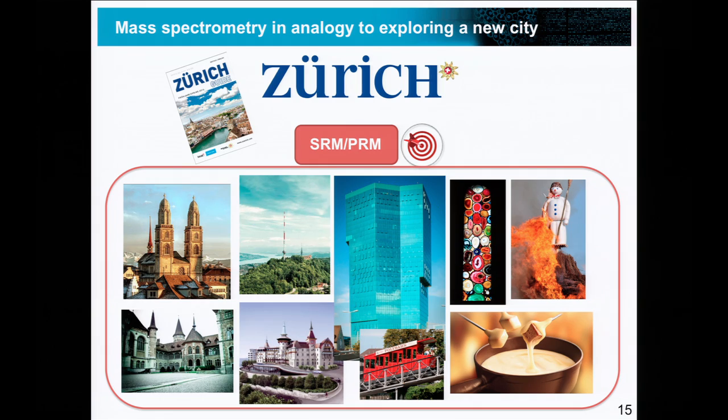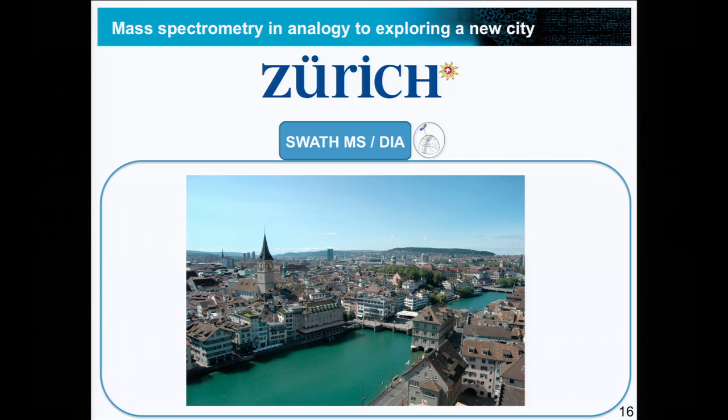And finally, a data-independent acquisition or SWATH way of sightseeing Zurich would be that you would come into Zurich and you would start photographing everything. Every house, every person, every street, everything. It would be a very, very stressful visit.